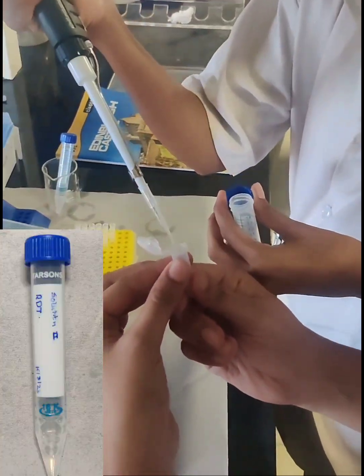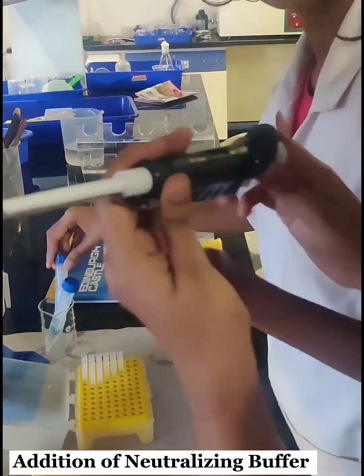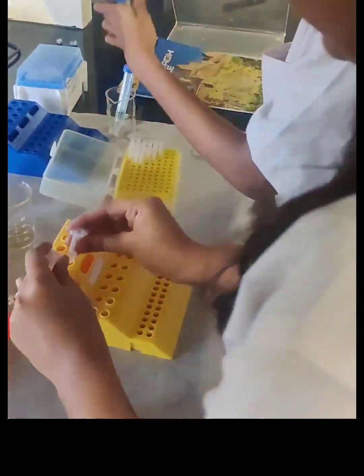Next, we added 200 µl of denaturation buffer, vortexed and centrifuged them. After centrifugation, we added 150 µl of neutralizing buffer and immediately inverted the vials five to six times.